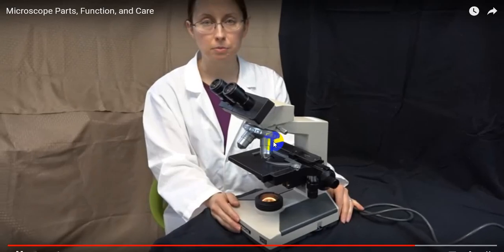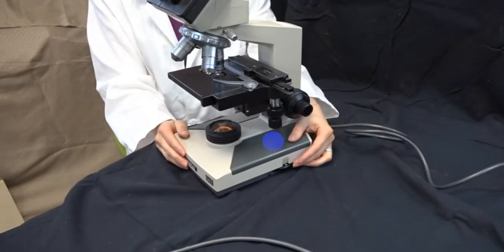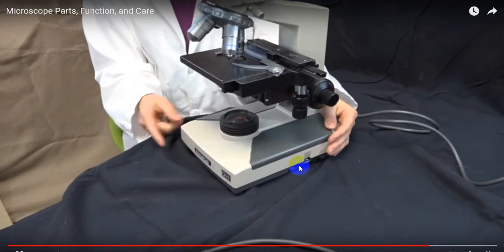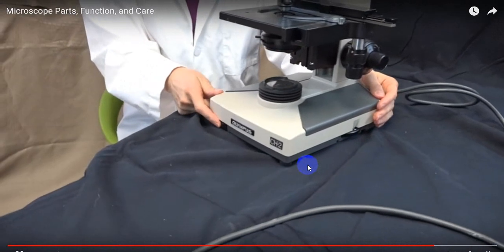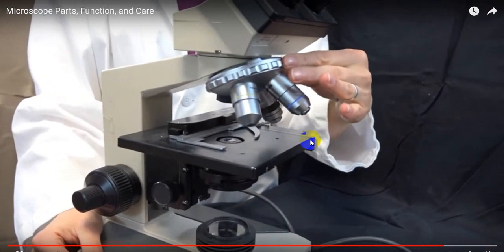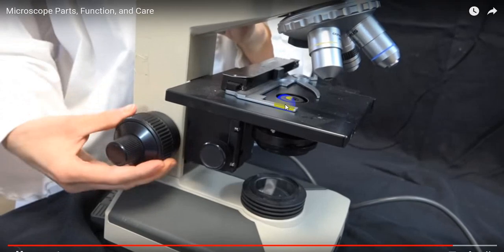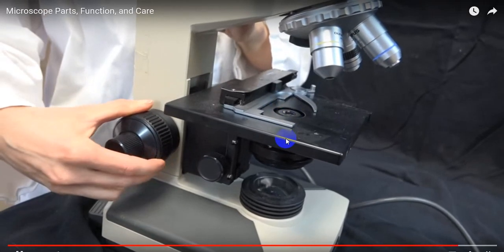How do you store a microscope? Put the microscope away. Begin by turning the light all the way down, and before you store it, turn off the light. Then rotate the nose piece so that the low power objective, the 4 times, is above the stage, and lower the stage completely.